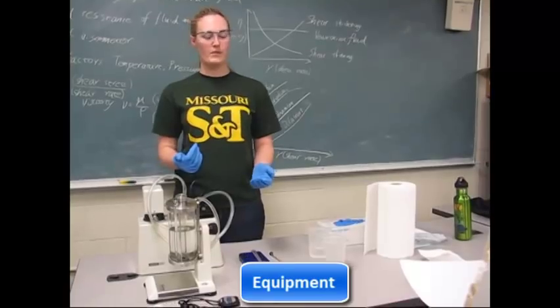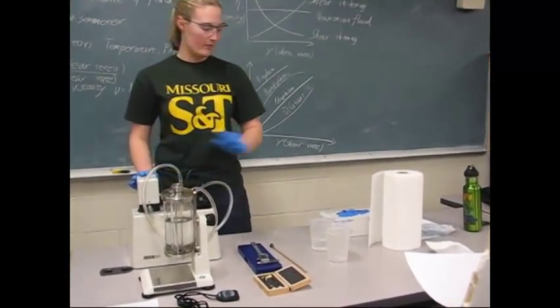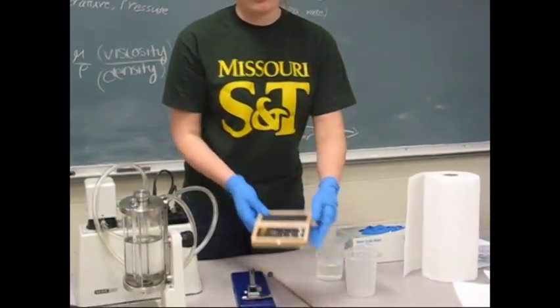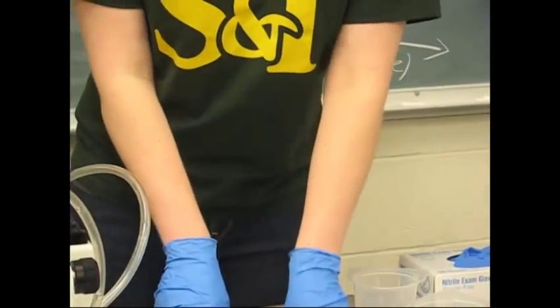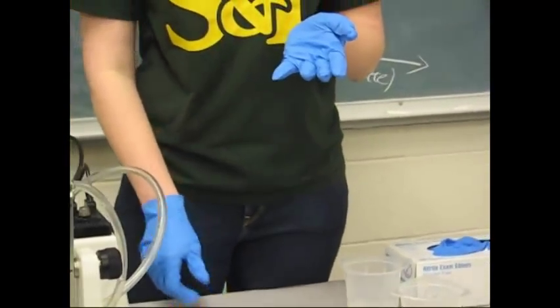The equipment required for this is going to be water, the falling ball viscometer, a circulator, a beaker or flask, the falling balls, a plunger, the caliper, and then gloves like I have on.